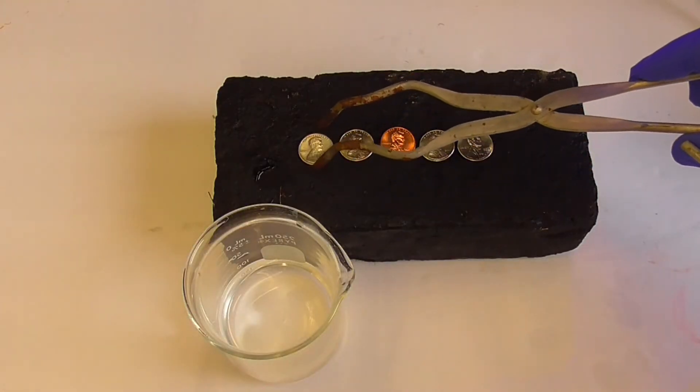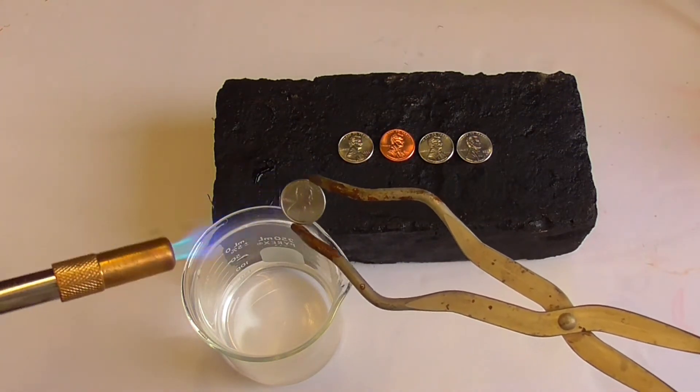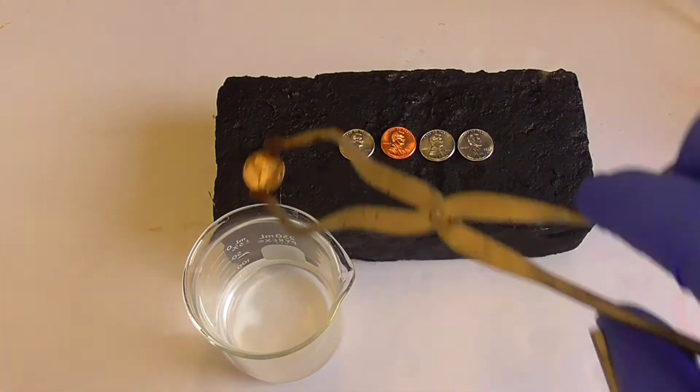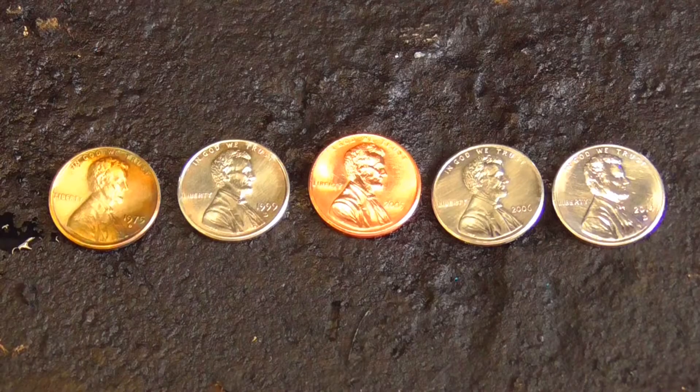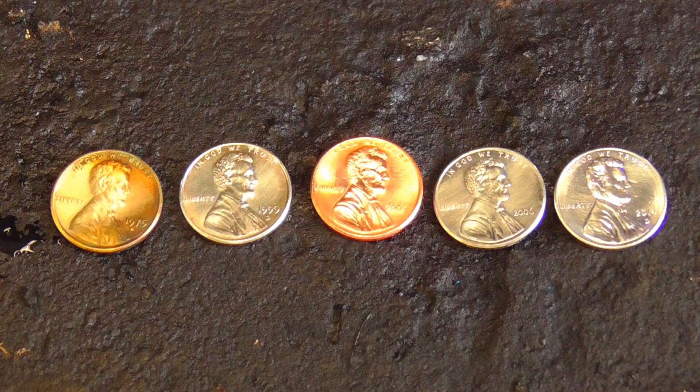I'm going to try heating one of these tin coated pennies to form bronze. Bronze is an alloy, a mixture of copper and tin, and it has a golden color. Hey, it looks like it worked! Here you can compare the colors of the various pennies: a golden colored bronze penny on the left, a regular penny in the middle, and three tin coated pennies.